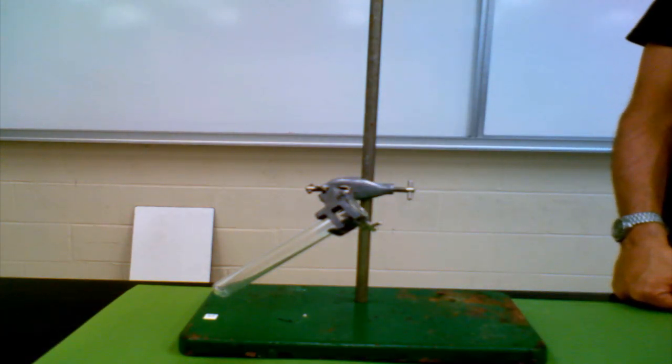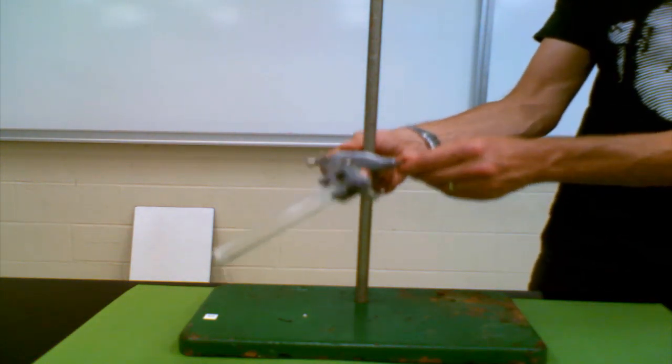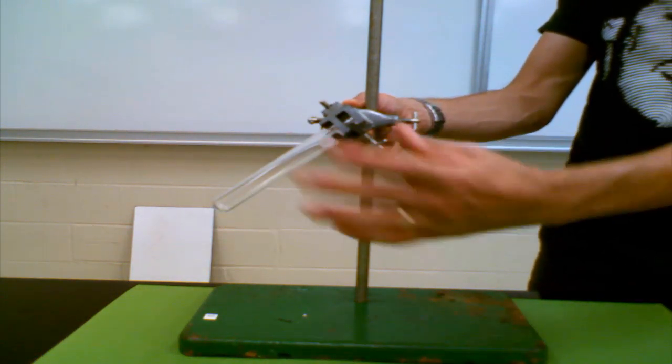That is the proper way to put a test tube into a clamp on the retort stand. Once it's in the clamp you can adjust all kinds of things.